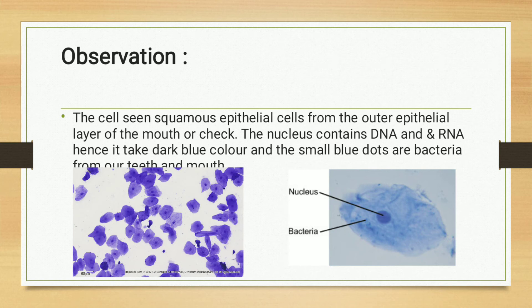See in this picture, the human buccal epithelial cell which is due to the methylene blue, it is in a violet color. These cells are squamous in their shape, so it is called squamous epithelial cell.